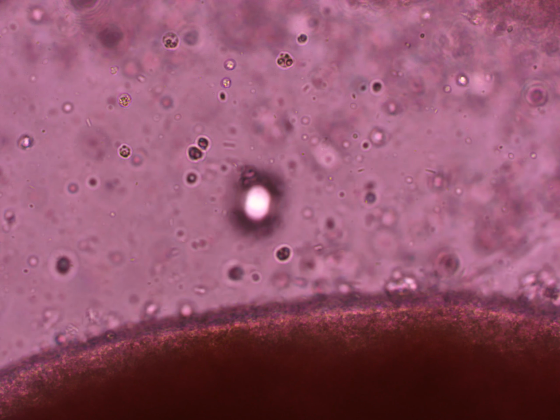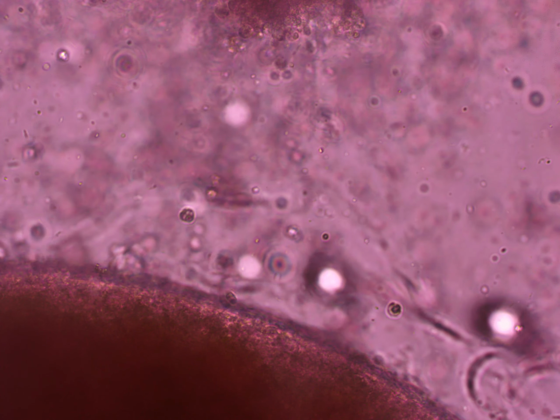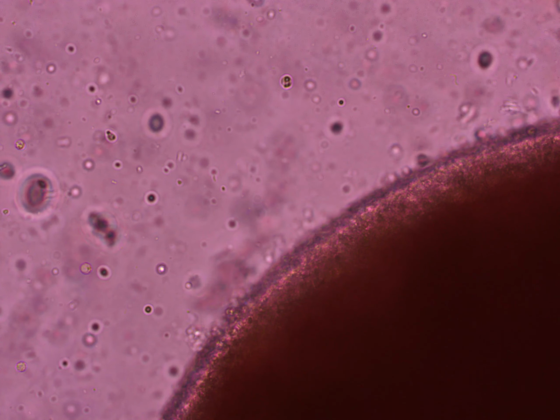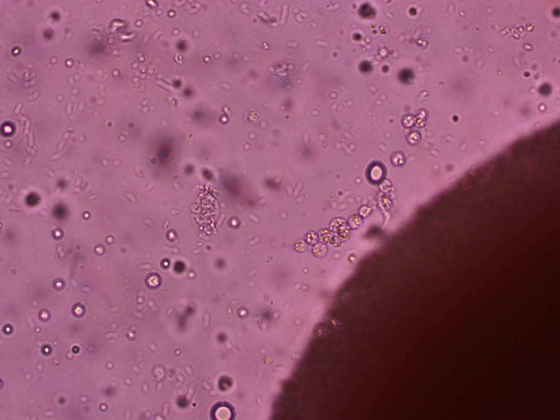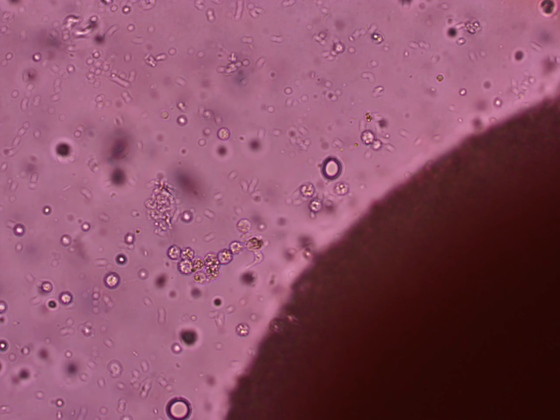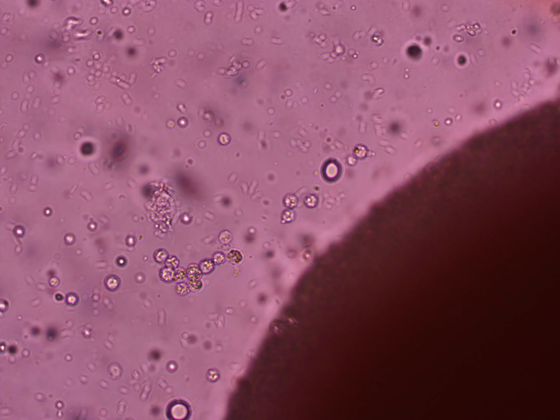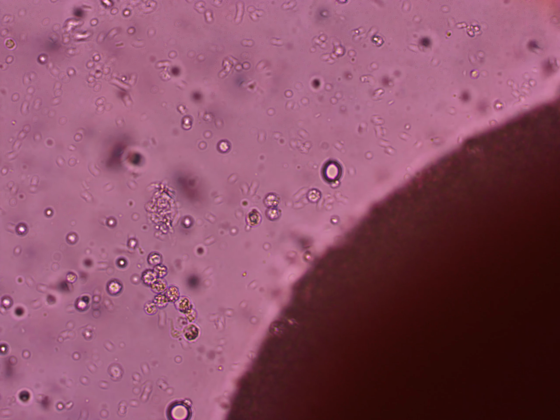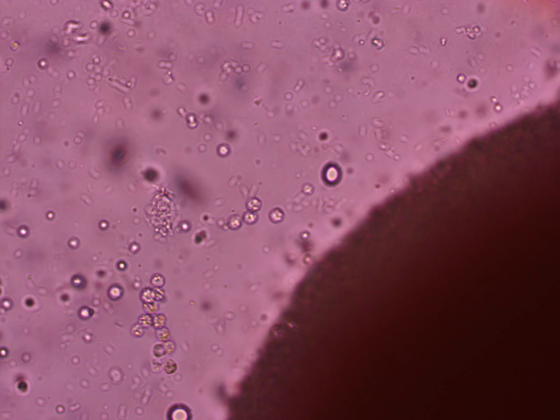See the insides of it there. It's almost like a stream of bacteria, which is pretty common. So I'm guessing this whole stream met up with it and is now attempting to attack it. And here there's a small formation of it. You can see it moving and pelting the sides of the egg, trying to break through the casing.